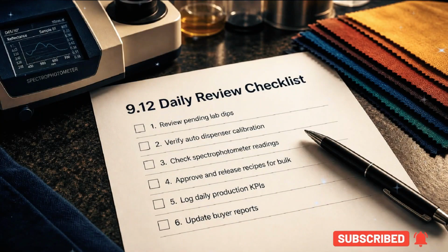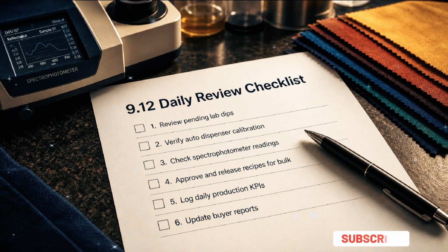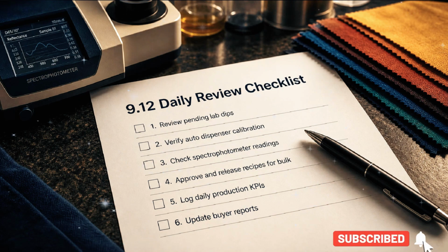Use a daily review checklist to ensure nothing is missed. This includes verifying auto dispenser and spectrophotometer readings, approving final recipes, logging KPIs, and updating all relevant buyer reports.